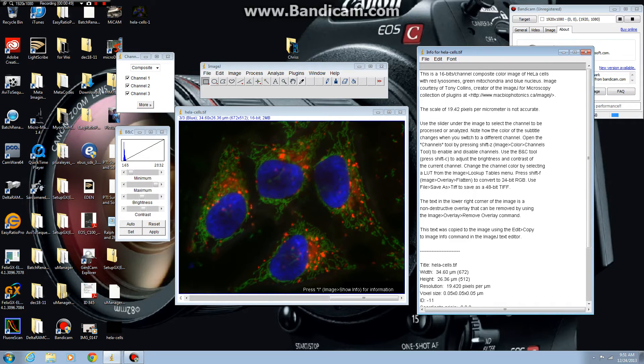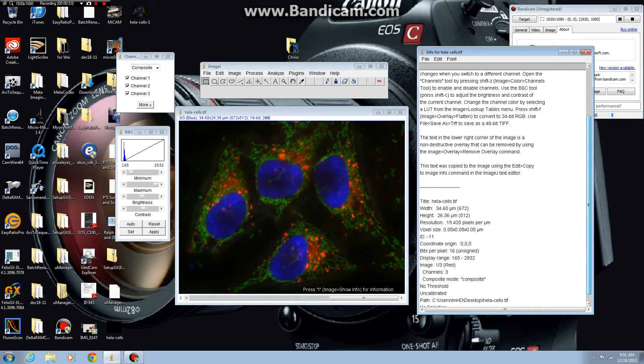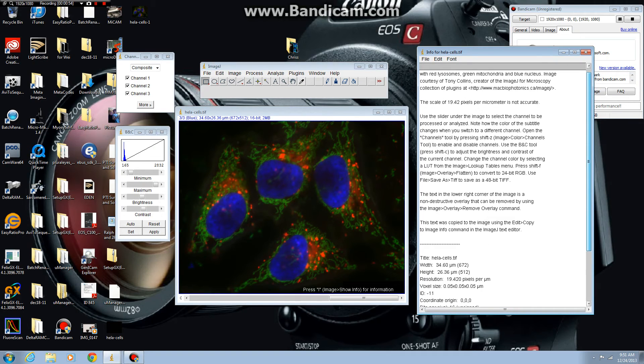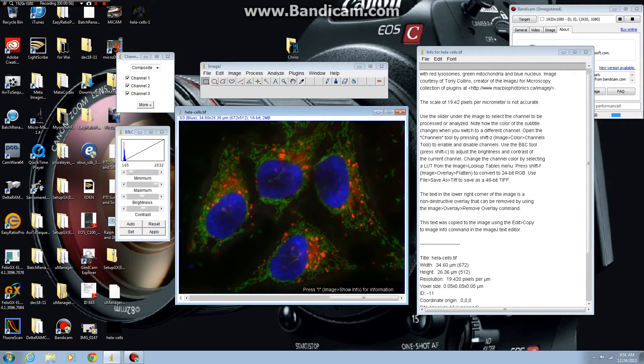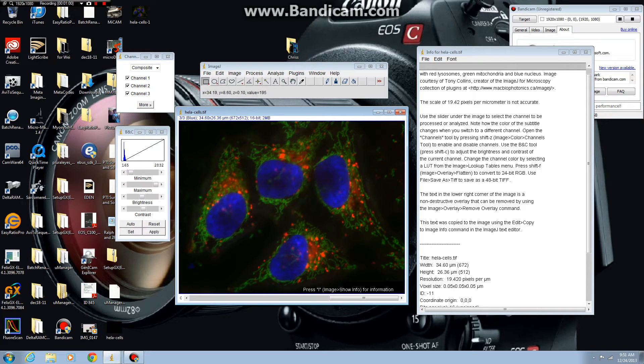You can see this text in this window explains how to operate the functions. What you want to do before saving the image is to flatten the image. To flatten the image, it's very simple.